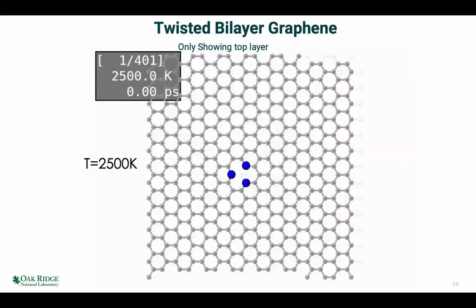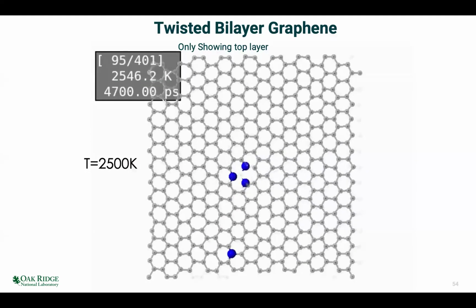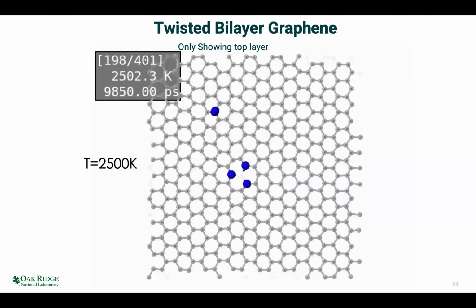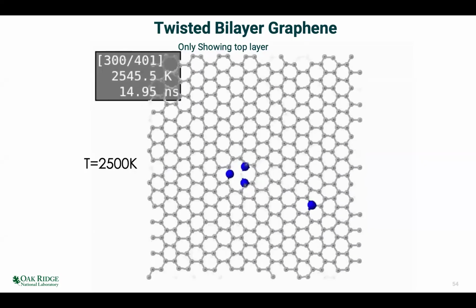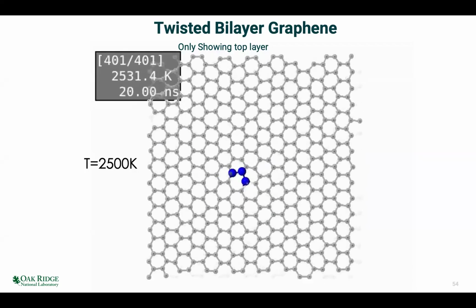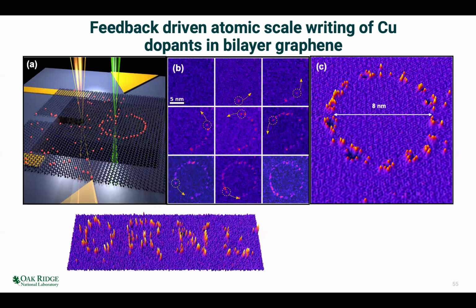Yeah. So we looked at a region that was 2 layers of graphene, right? And it ends up that everything behaved very nicely there. We went back and looked at the modeling. It ends up that even at really high temperatures, just having that other layer below was enough to slow down that diffusion process. And so we could keep it nice and hot, nice and clean. We could drill, make a defect, and it wouldn't run away before we tried to make another one, right? And so on bilayer graphene, everything worked as we wanted to, and we could start to write structures like this and do our most important work there.